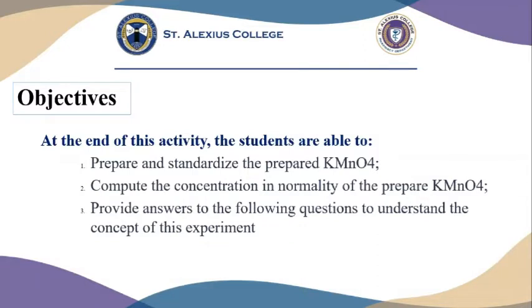Our objective for this activity is, at the end of this activity, the students are able to prepare and standardize the prepared potassium permanganate, compute the concentration in normality of the prepared potassium permanganate, and provide answers to the following questions to understand the concept of this experiment.